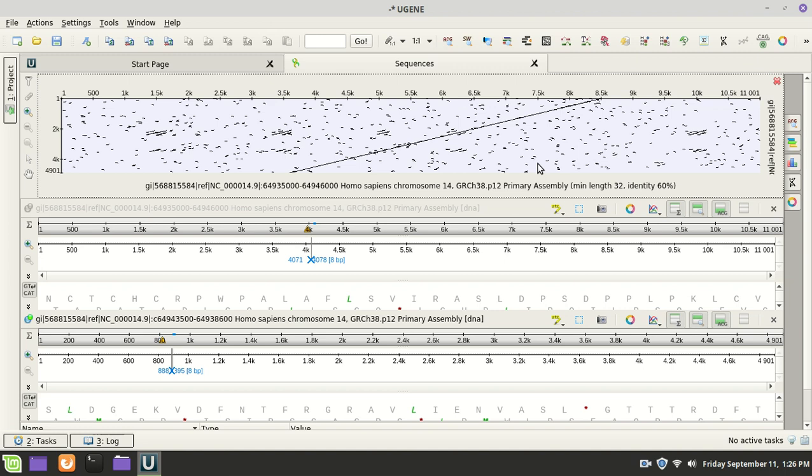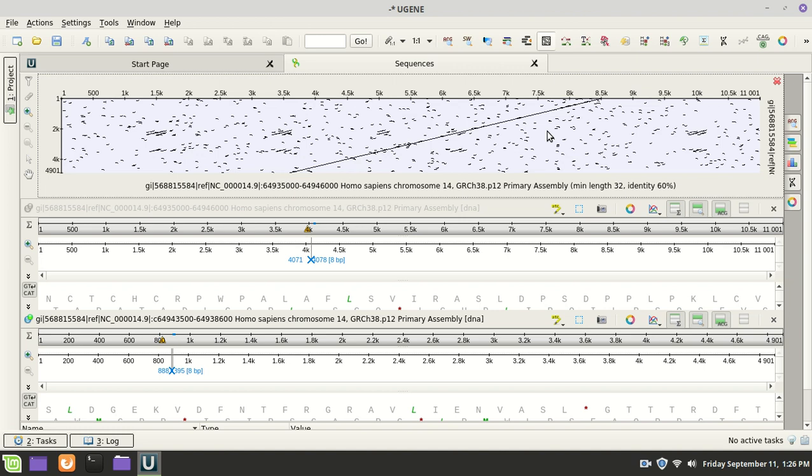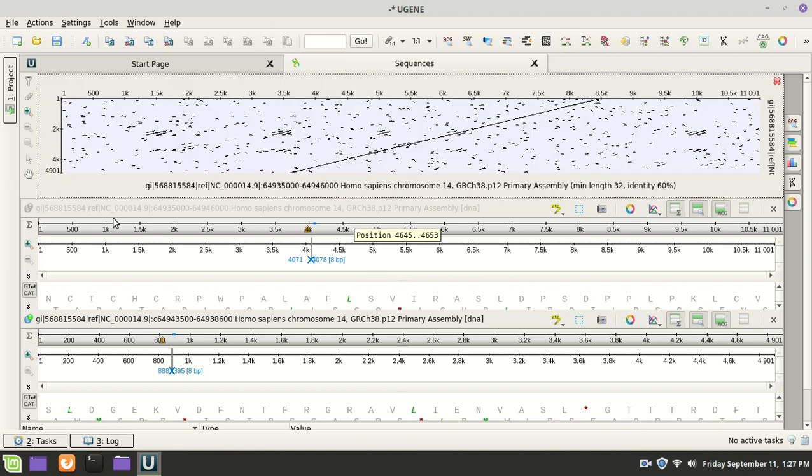Well, actually what this tells us is something that I should warn you about. What we have here is we were comparing a DNA, and this says it's DNA on this particular chromosome.